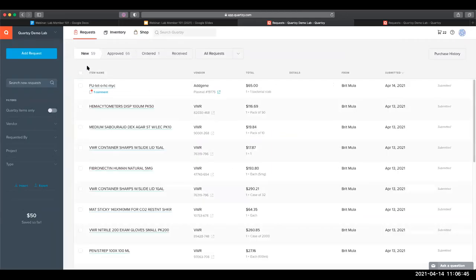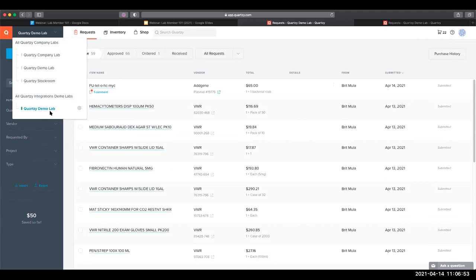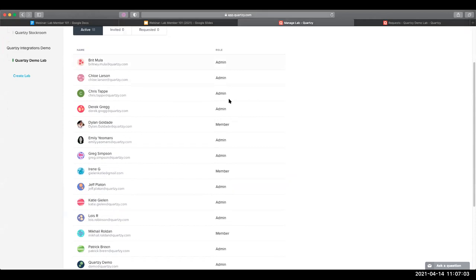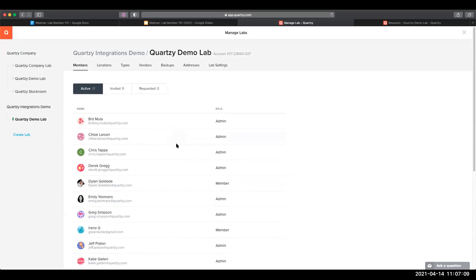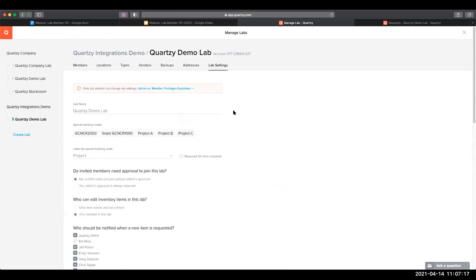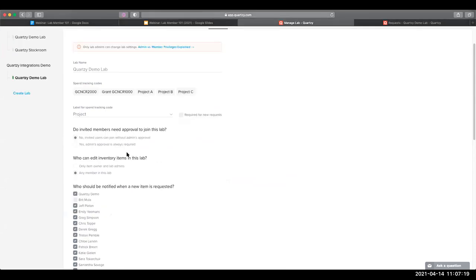Next up, we'll go over how to view and manage your lab's details. In the top left corner, I'll open this menu to select the lab that I'm interested in. And then I'll click on this icon to get to the manage lab pages. First off, you're going to see this members tab, and this is where you can see a list of all current members and admins in your lab. And next, we'll head over to the lab settings page, all the way to the right here.